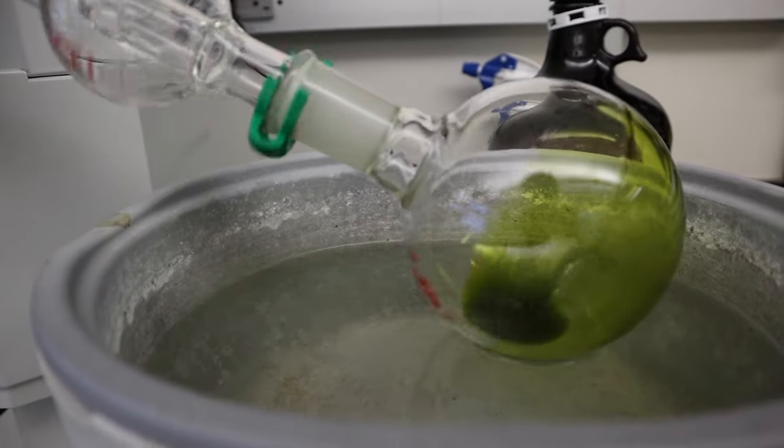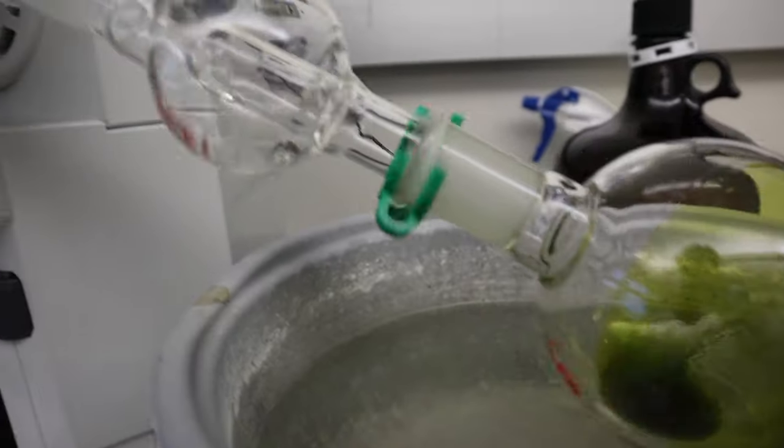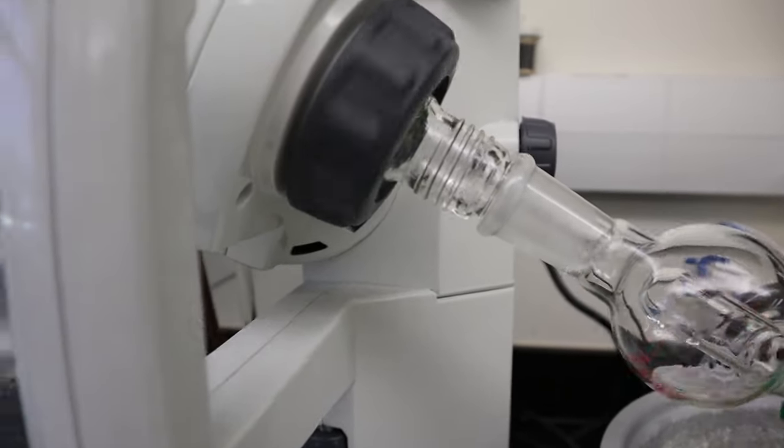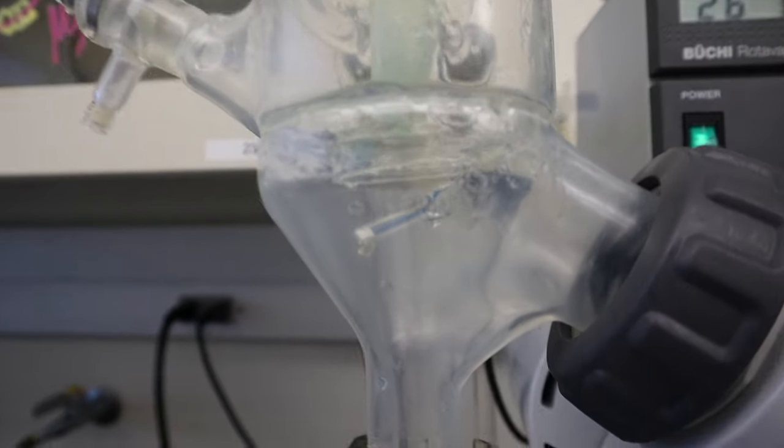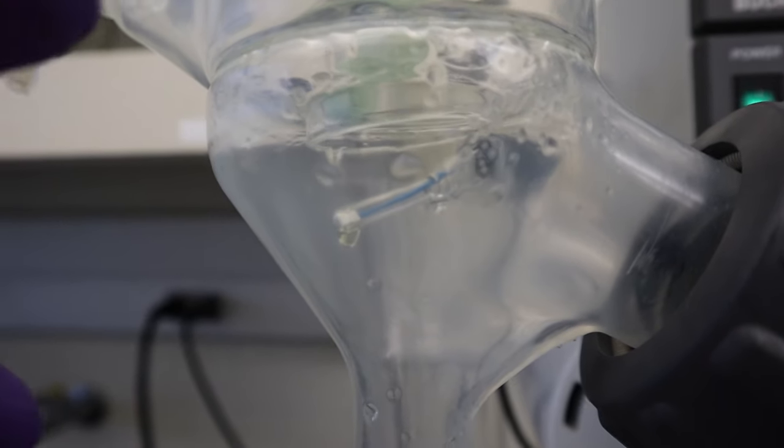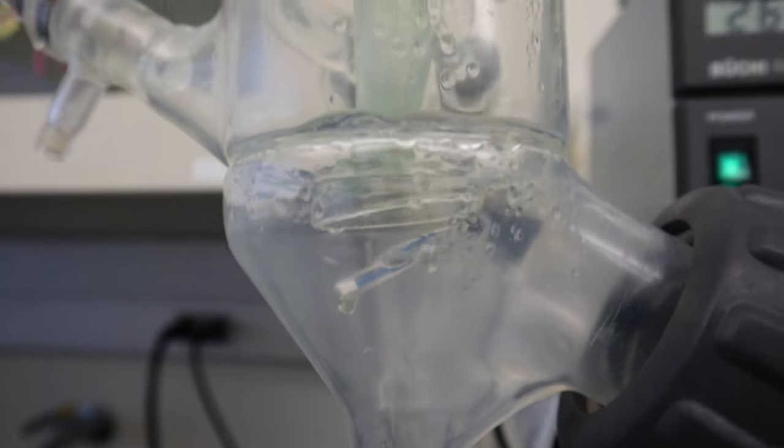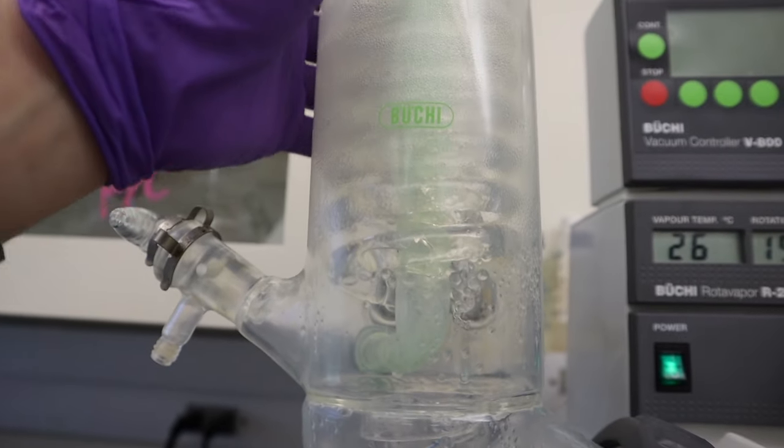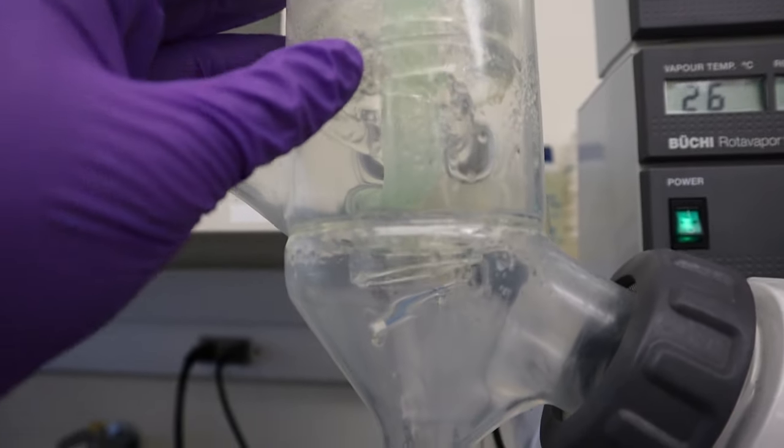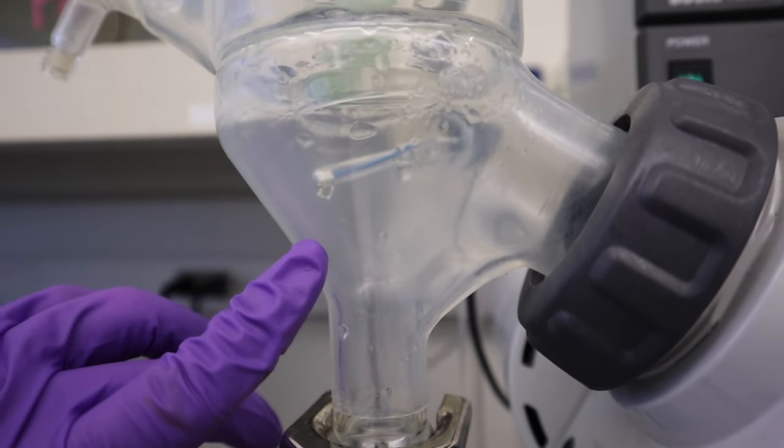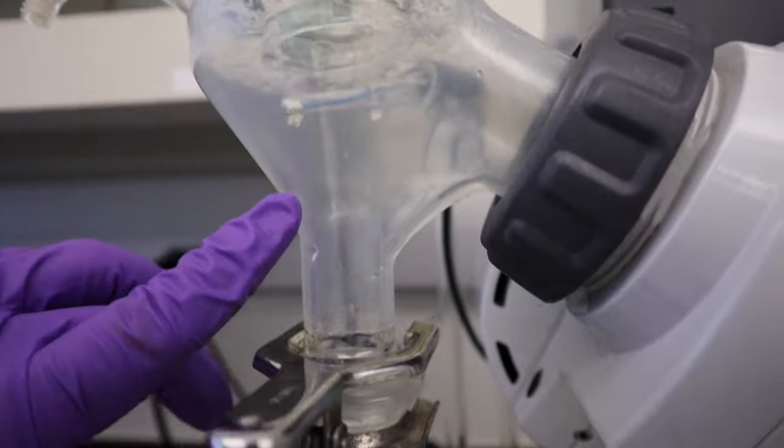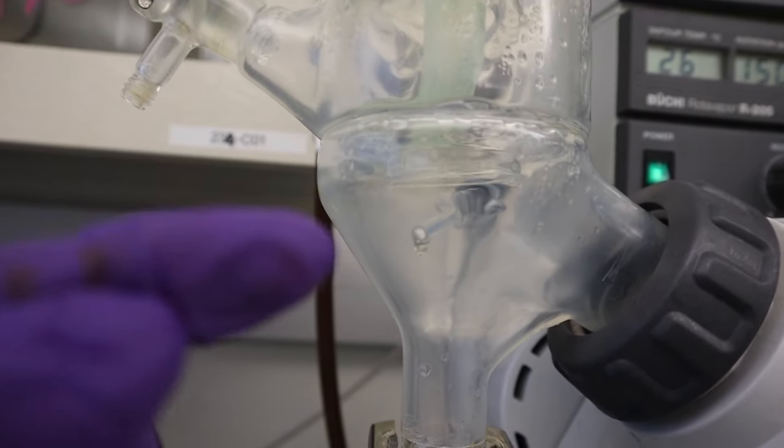As you can see, the process has already started. The solvent is already evaporated. See those droplets? It means that the solvent that evaporated is already condensing, turning it into its liquid form, and it will be collected here. That's pretty cool.